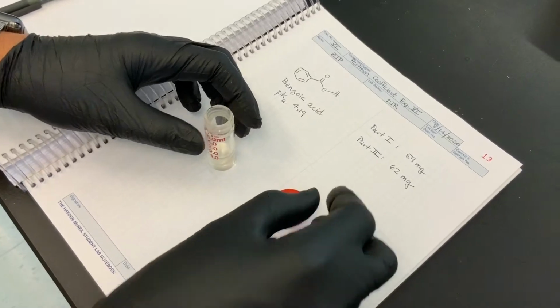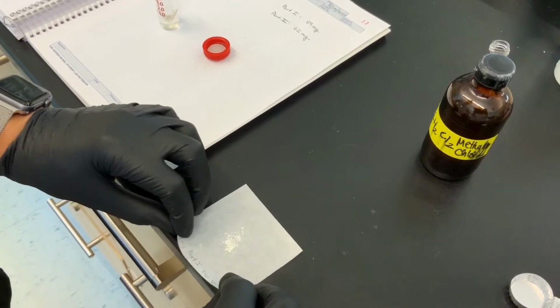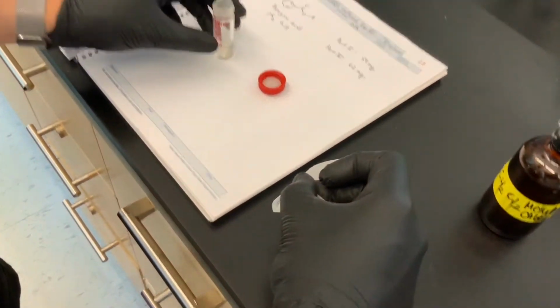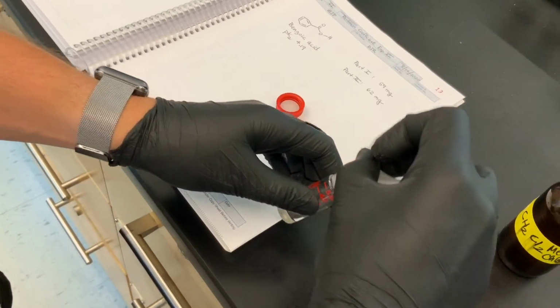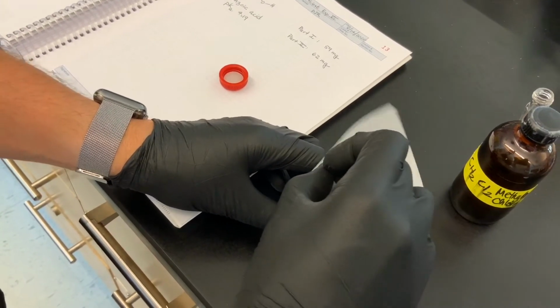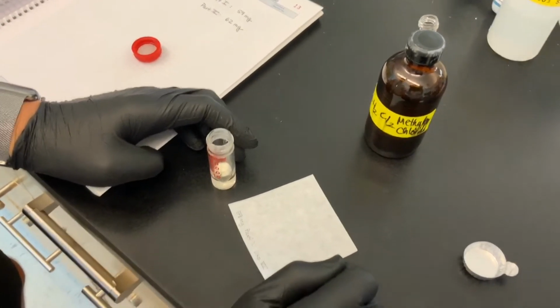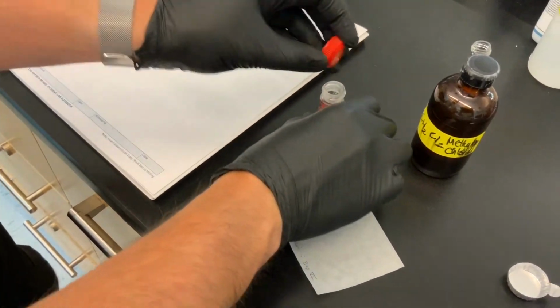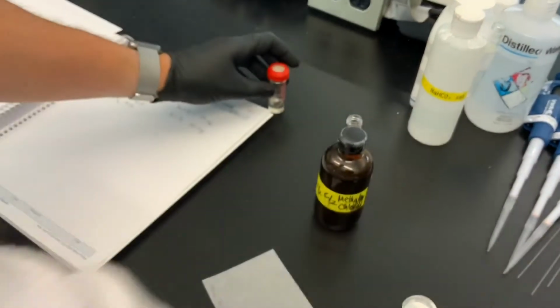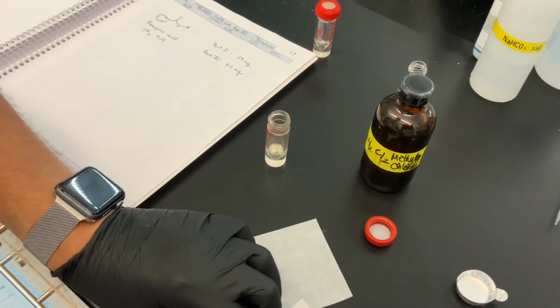So for part 1, a lot of people like to bend the weighing paper to transfer, but I like just pinching the 2 edges here on the same side, creating a little funnel, and then we've got pretty much a good quantitative transfer. If I wanted to, I could also scrape some off with my microspatula, but this sort of spilled off pretty well. So this will be for part 1. Set it aside for a second. And then for part 2, we've got another reaction vial, and this was 62 milligrams.